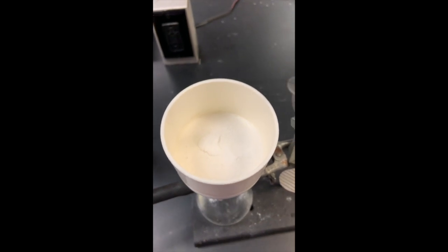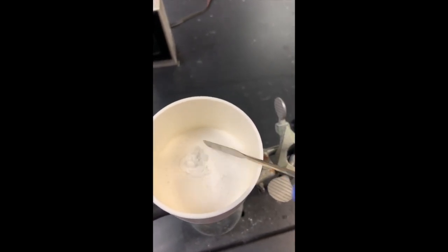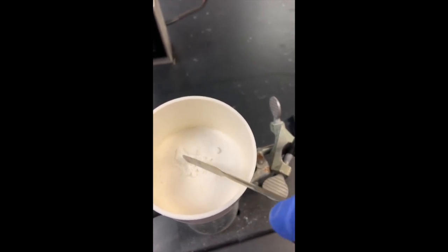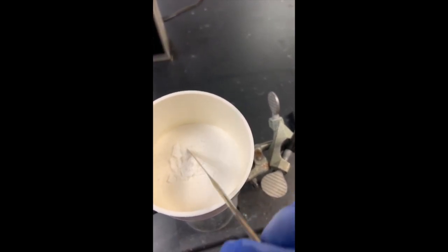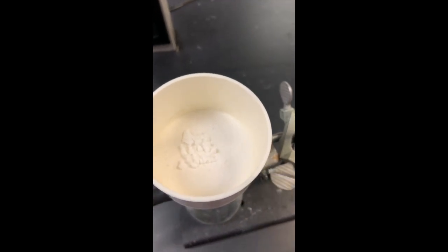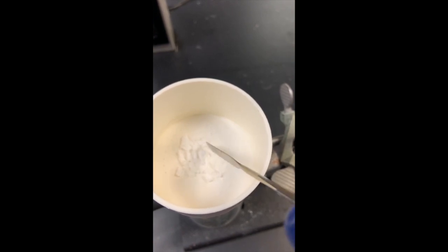I forgot to add, I actually am going to just scrape my filter paper a little bit first because the filter paper can get too saturated and it's almost as though it gets clogged, so it doesn't dry out as well as I would like it.